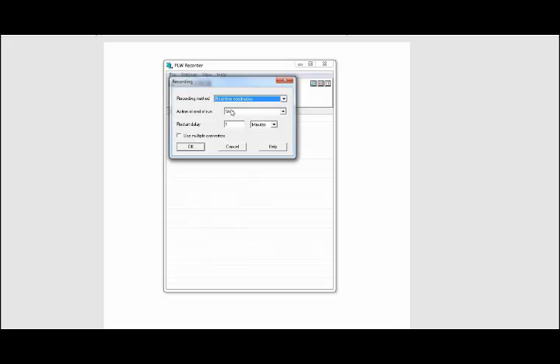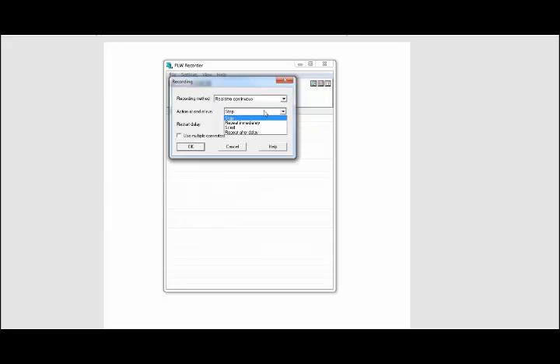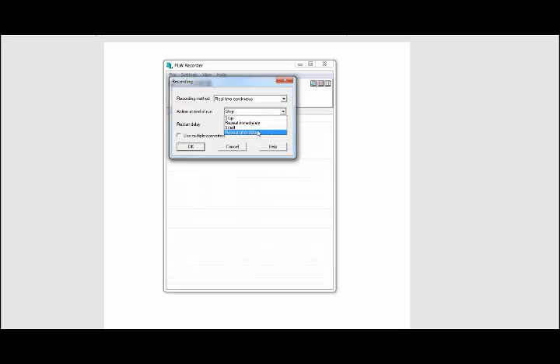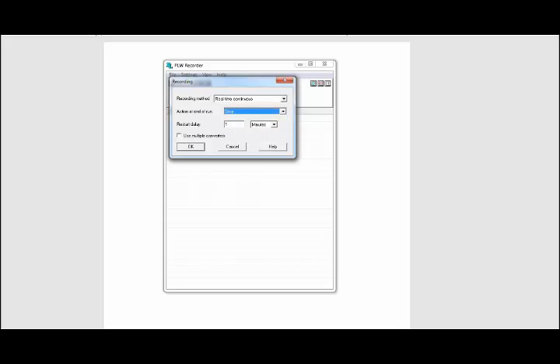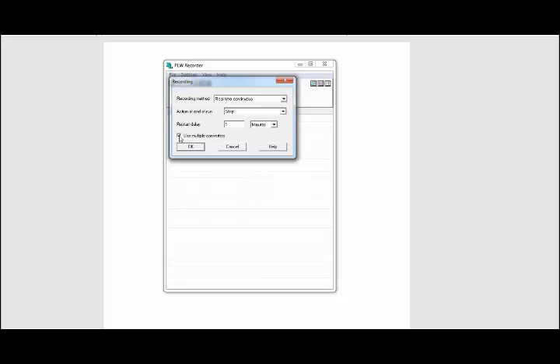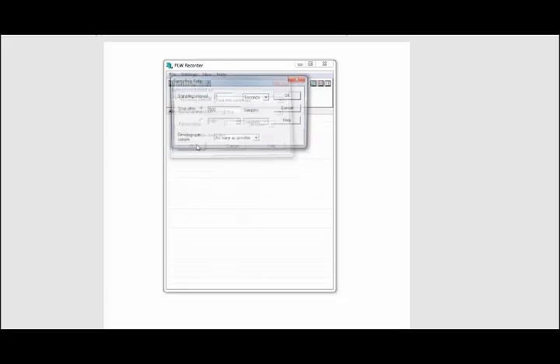Action at the end of the run basically tells the software what to do after it's done capturing. The default is Stop. You can tell it to repeat immediately, so it immediately starts recording to a new file, or you can tell it to repeat after a delay, like 5 minutes. Since we're using multiple TCU8s, we'll need to put a checkbox next to Use Multiple Converters, and then click OK.